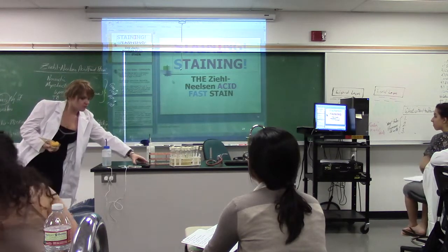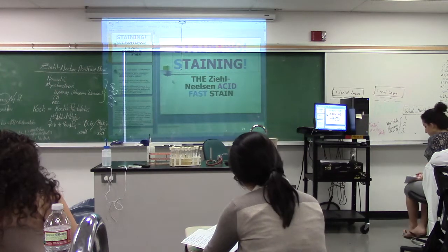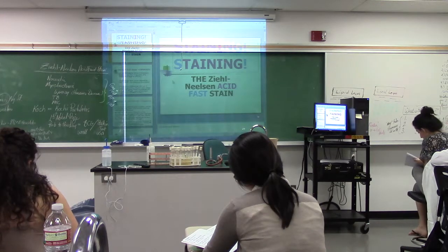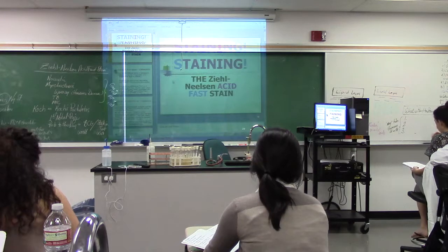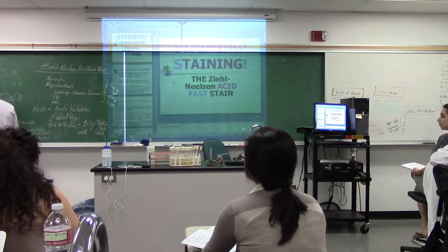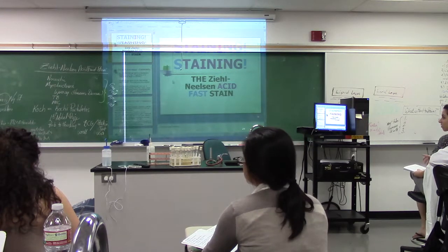The key to the endospore stain is one word: holes. Like in your brain, cheese, holes. Okay? All right, or in your head. So anyway, we'll talk about endospore stain interpretation, theory, and problems, and we're going to have a pop quiz on reading all the stains, and it's called Name the Stain Game, and that will be the pop quiz on Wednesday.